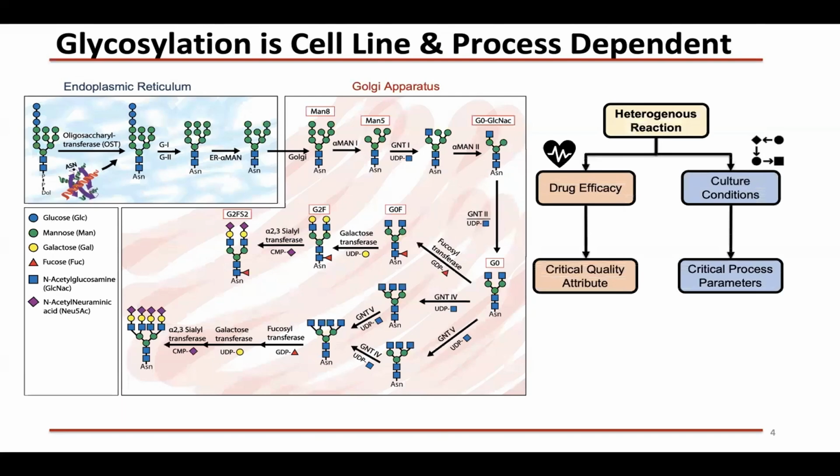But the challenge is that the type of glycosylation you have has an important impact on the efficacy of the drug molecule, so we have to be able to monitor it and control it using suitable process analytical technology. This is where my lab has been making advances in developing process analytical technology for monitoring glycosylation in near real time. And what I will now do is hand the baton over to Dr. Aditya Narvekar, who's going to present the rest of the talk.